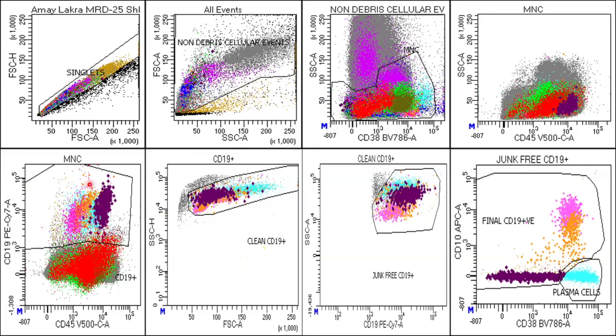Okay, so we have the mature lymphocytes, we have the stage 1, stage 2, stage 3 hematogones, and we have the plasma cells. So these are the basic cells that we have to analyze, and we have to differentiate the leukemic cells from the stage 1, stage 2, and stage 3 hematogones versus the leukemic cell phenotype. So we have taken up the CD19 positive cells with a broad gate on the CD45 axis, because our leukemic cells can be CD45 dimmer, we can have a CD45 bright cell, we can have a CD45 moderate cell. So basically we have taken up the CD19 versus CD45 broad gate, and these CD19 positive cells have been further refined on a side scatter forward scatter plot. We have removed the junk over here.